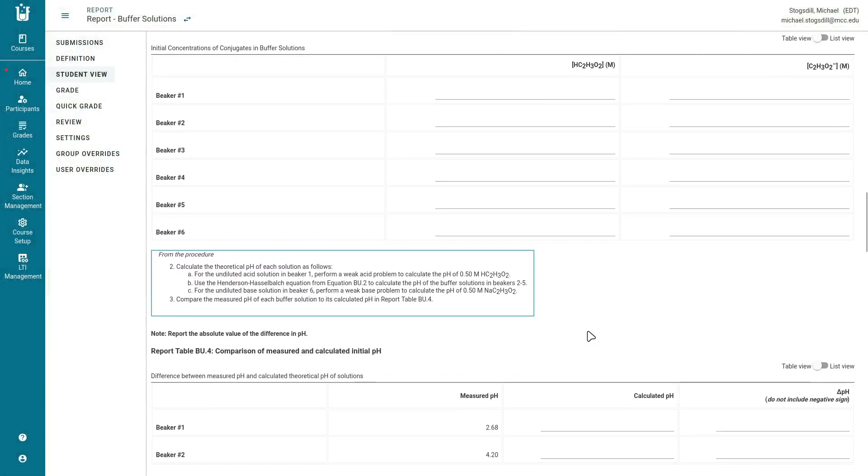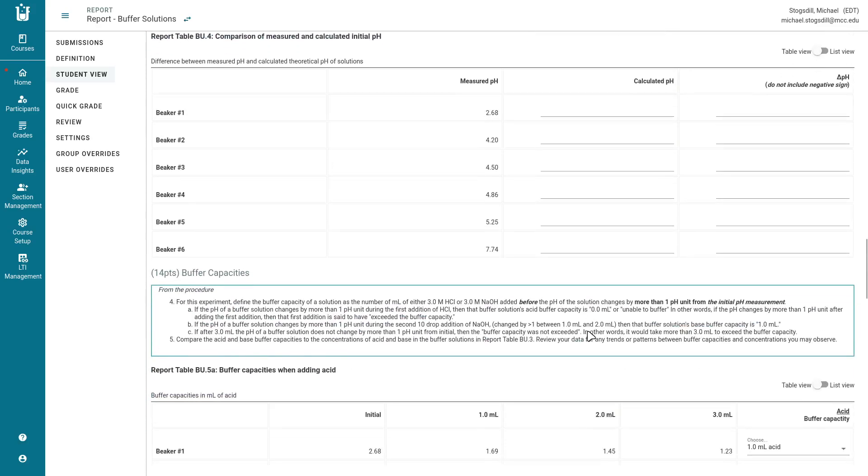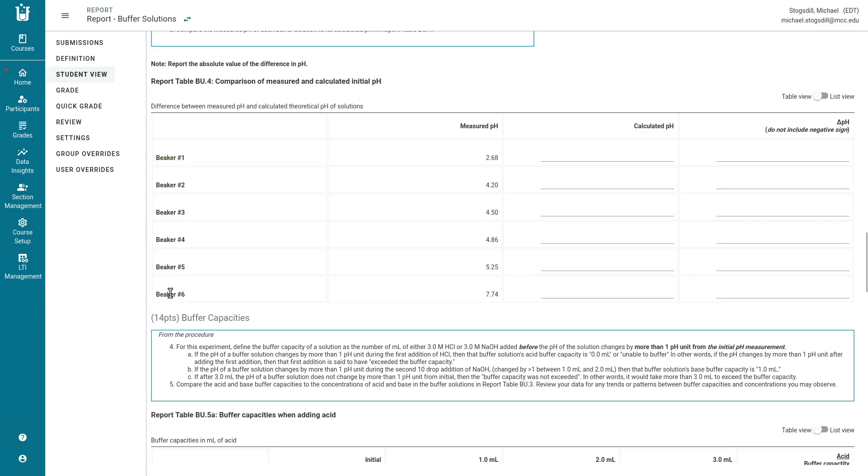After that we come here where what we are looking to do is compare the measured pH for each of these solutions to the theoretical calculated pH. So there are three cases here. We have beaker one where we just have acid, beaker six where we just have the conjugate base, and then beakers two through five where we have a buffered solution.